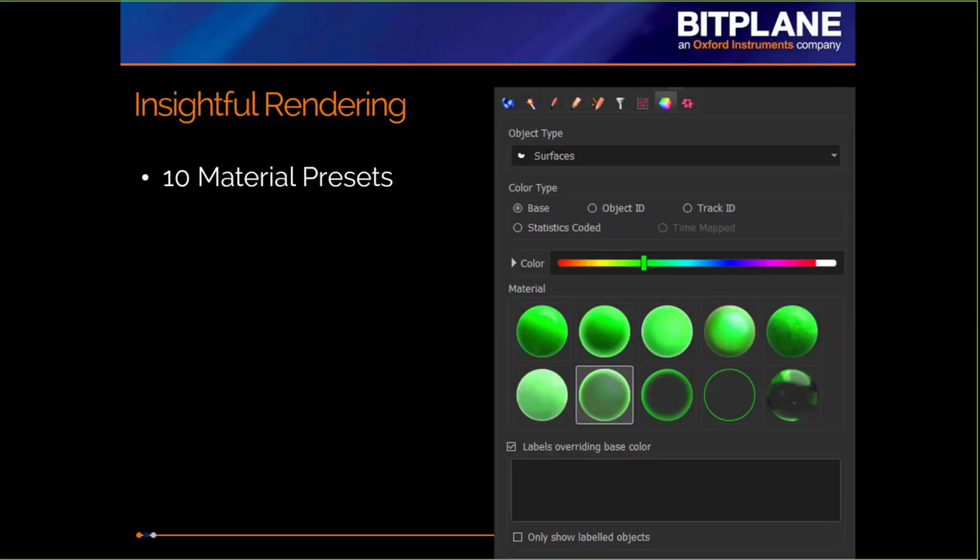So really, we know that your story cannot depend completely on pretty pictures. And so this rendering is not just about being very pretty, but also because it reveals more information.